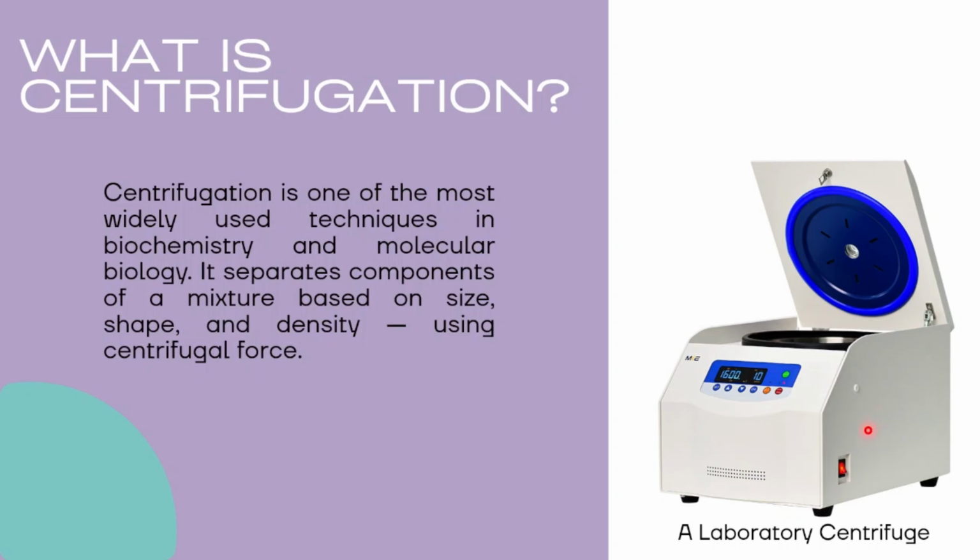So this is a laboratory centrifuge. It should be noted that centrifugation is also used outside the lab in industries that separate other kinds of mixture, such as the petroleum industry.